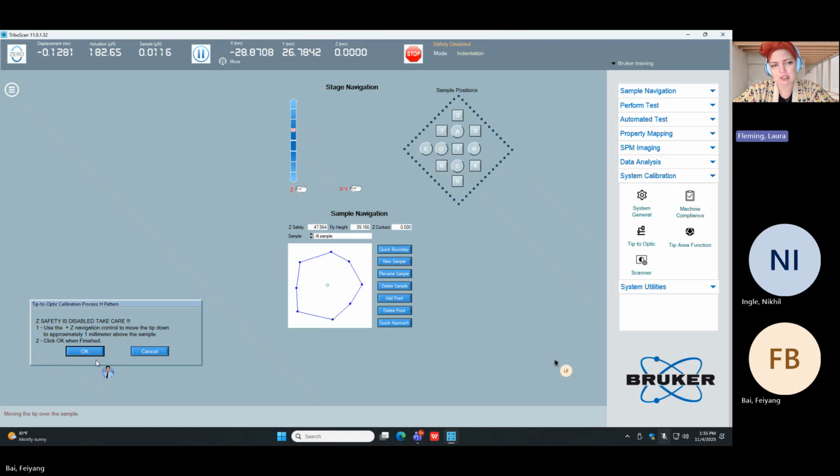Those two operating procedures are very different in how you think about the use of the instrument. So it's really hard for us to come up with a document that I can give to a customer and guarantee that it is the correct use case for their system. Of course. But that being said, we're happy to work with every customer to make sure that the nuances necessary for their SOP are captured if they want to write something down.